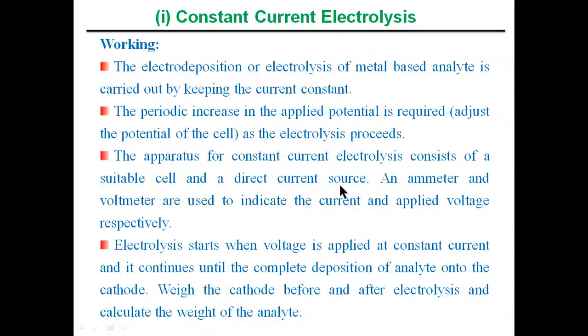It's very simple. We will discuss constant current electrolysis more by taking a simple example, that is the determination of copper using this constant current electrolysis method. So we shall see that in the later videos.